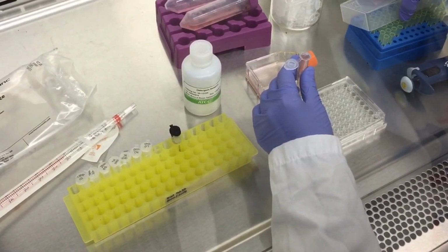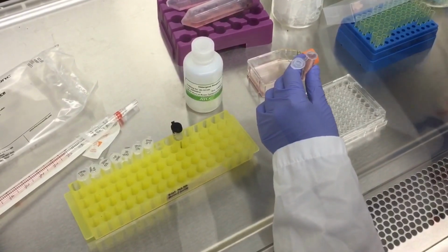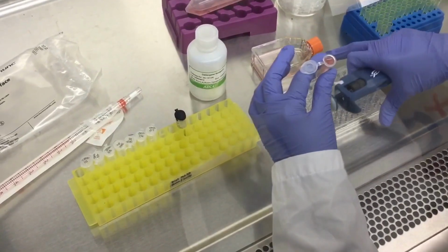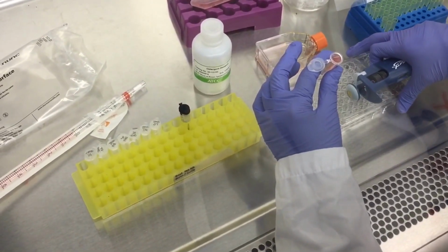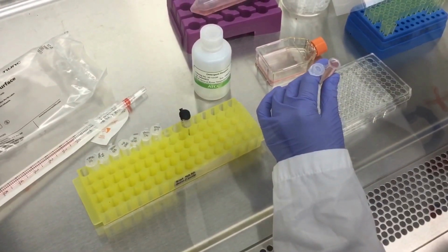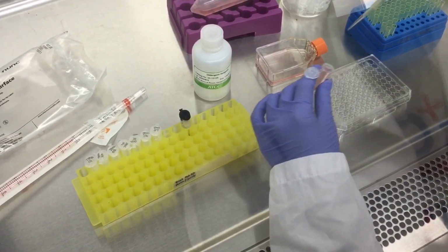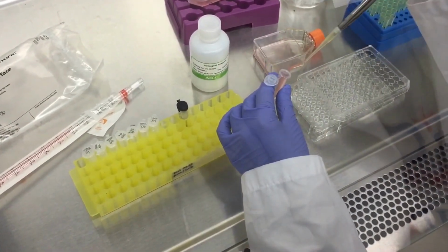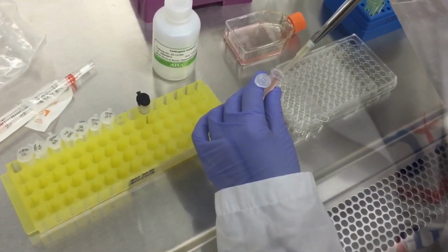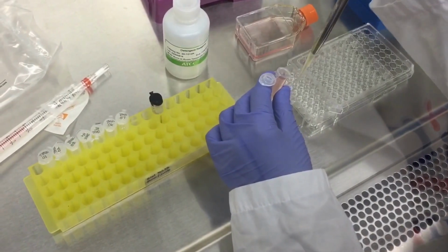Okay, after you've taken out the number of cells you need, you would now pipette in 50 microliters of cells per well. And today we're going to test out 8 compounds in total. One of them is a negative, one is the control, and 6 that are compounds that we're going to test. And for each compound, you would do duplicates, so if you're testing 8 in total, you have to do a total of 16 wells.